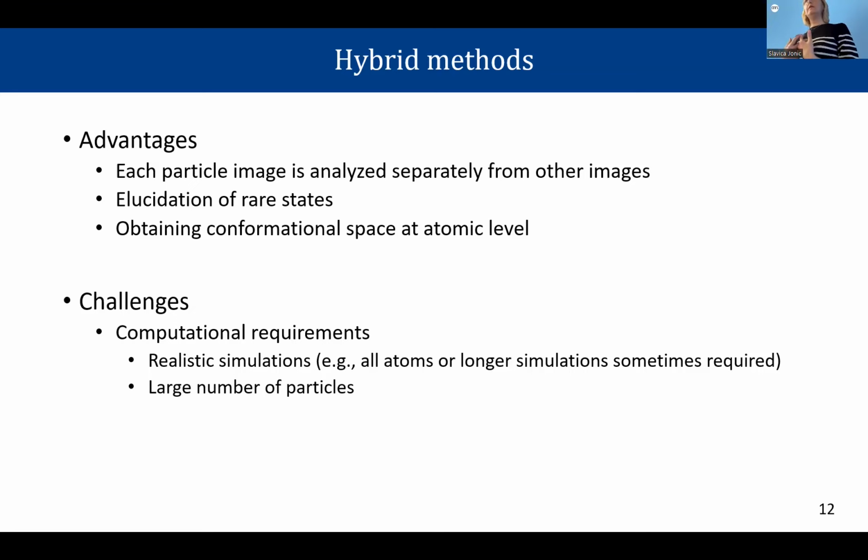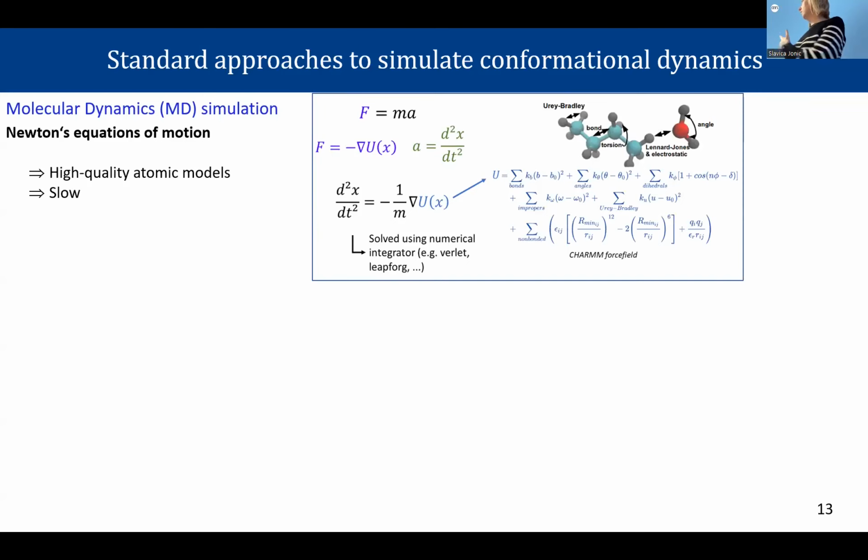But I believe, and at present I don't know how to explain this, that we are able to get conformations that look reasonable and as expected with short simulations, like 40 picoseconds. It is quite short, but that is because we are using this carbon alpha Go model and not CHARMM for the potential.